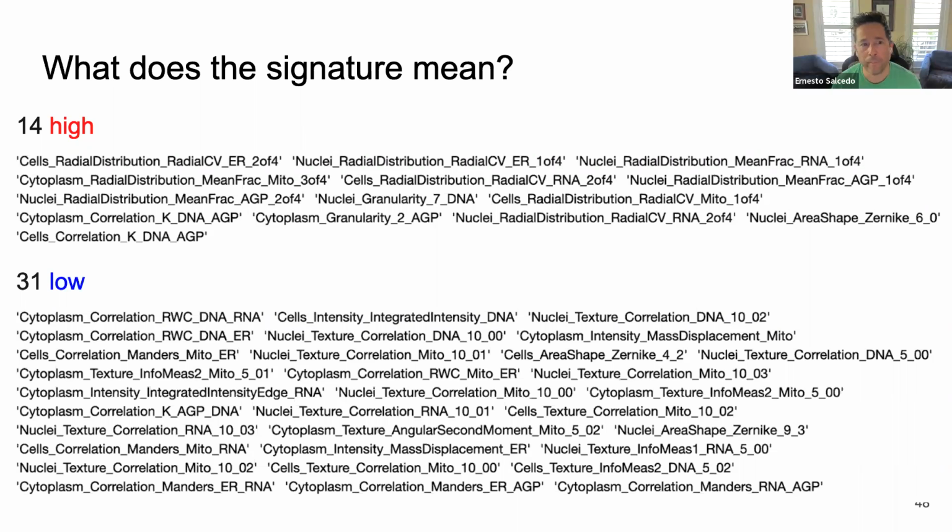I have two questions. First, I assume you're doing 2D projections of these images, not 3D analysis in CellProfiler. And second, can these be modified to analyze tissue as opposed to just individual cells? The answer to the first question is most of the time we do a 2D projection from some small range of the Z-stack, but it's possible to do 3D. It gets more complicated, and this morphology analysis is much easier in 2D, so we tend to stick to 2D.